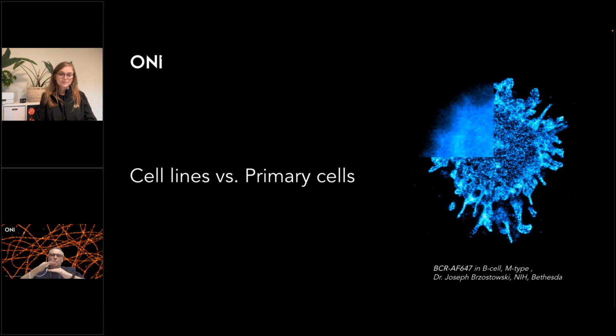But then you need to put a small cover slip on the top of it. And then you will need to reverse your slide and image through the thinner cover slip. Those are some of the few tricks which you could do in this case. But ideally, I would recommend maximum the cover slip number 1 in this case. 1.5 could be an edge.